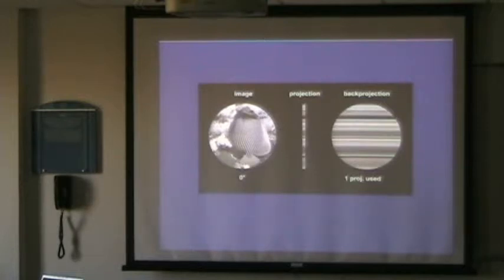So the point is this, that no matter what kind of lens you use, your eyes, photo lens, electron microscopy lens, what the lens is always doing, it always screws a dimension, okay, in the projection direction. Now this fish here is already screwed because of this lens up here, provided I would have a real fish up there, which I don't obviously, but you know what I mean.